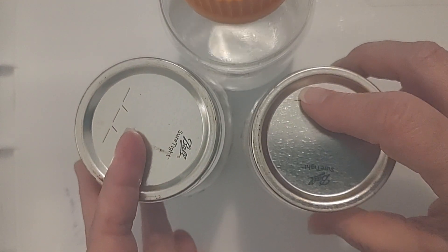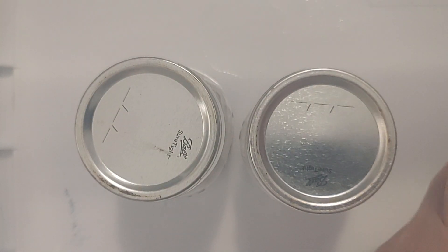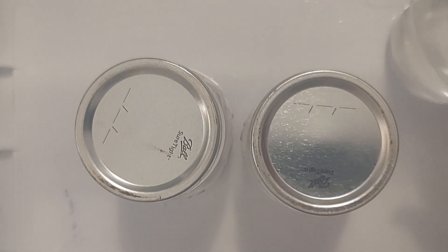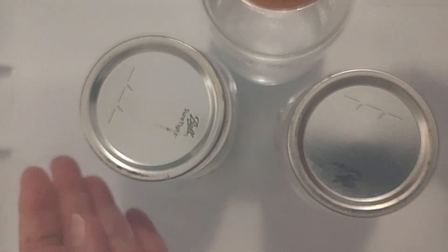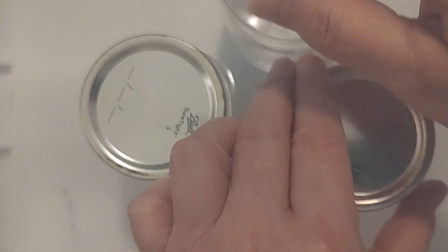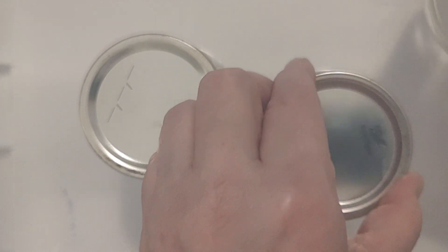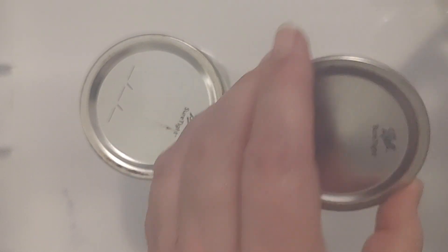I'm just going to pour 100 milliliters each into these jars and then we're going to create the slurries. This is a real-time video here for you guys. I am just opening this jar — it's unscrewed for me. I'm going to go fast. The seal was released, so now I can go really fast. I can see on the side it's 100 milliliters. Quickly put the lid back on. Got a little bit extra, so we'll go here.